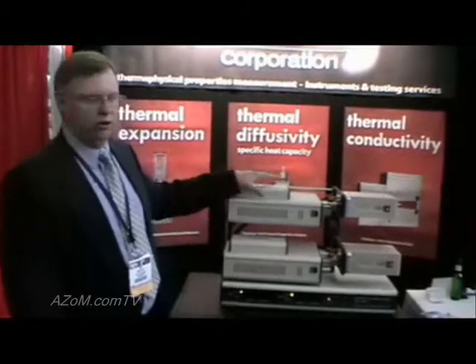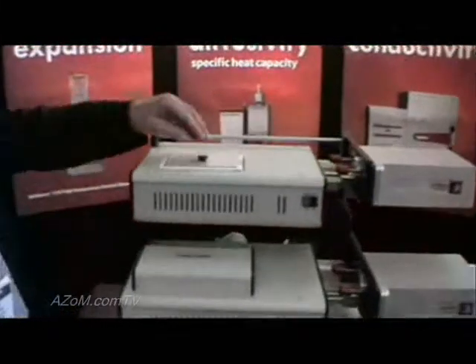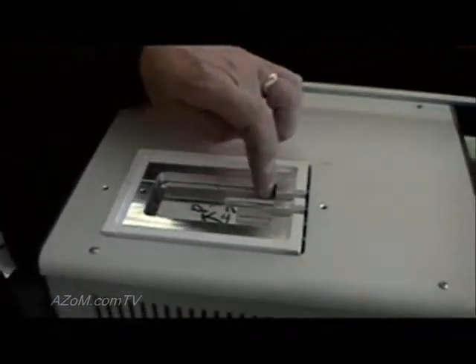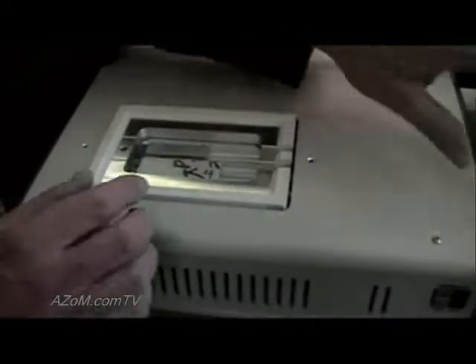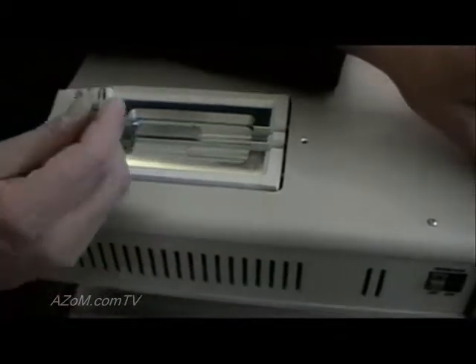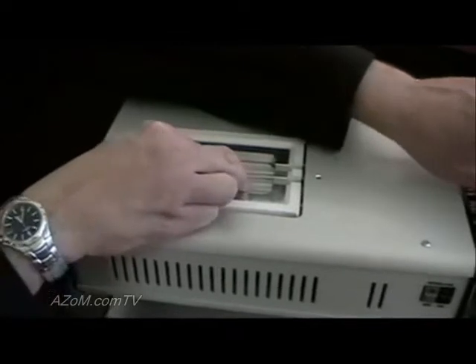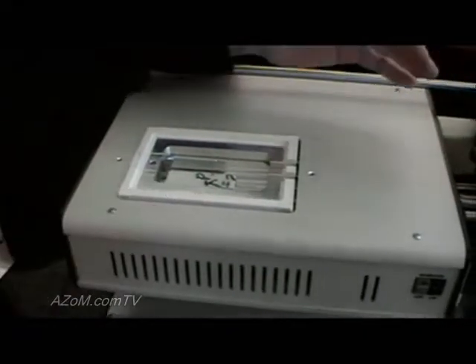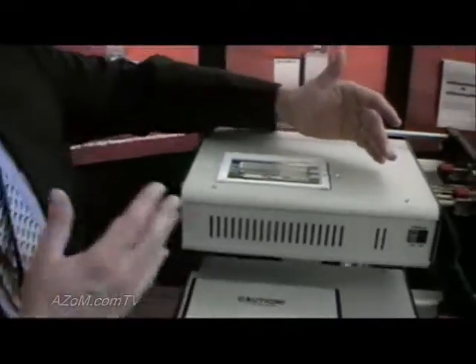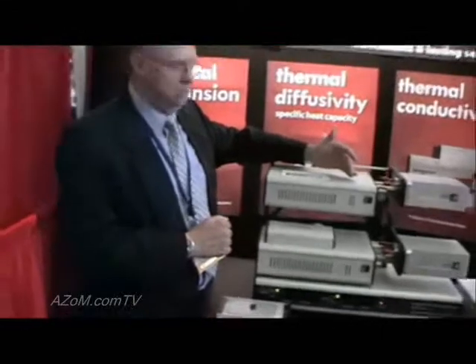This particular furnace that we're showing now uses a plate type furnace where the specimens are in direct contact with a heated plate. The benefit here is that when we're testing materials that are low thermal conductivity, like plastics, we have good heat transfer. So whenever we test the materials over a range — in this case maybe from minus 150°C up to plus 200°C — we can test them at a continuous rate without having to do isothermal steps.